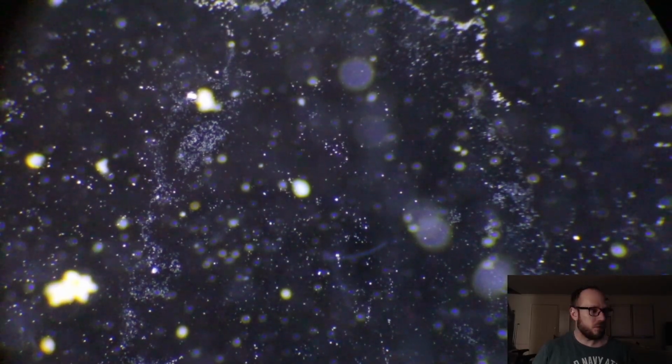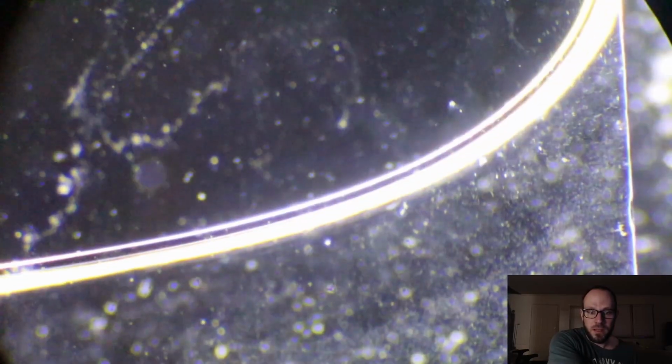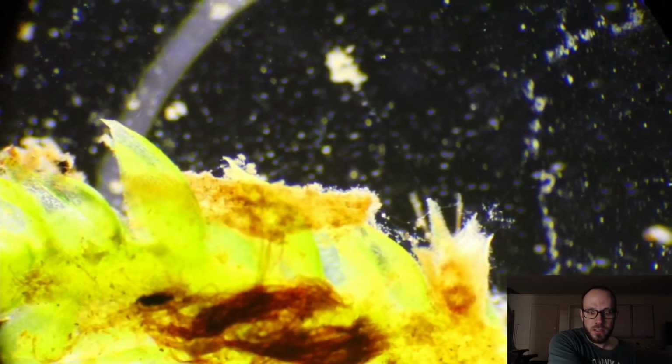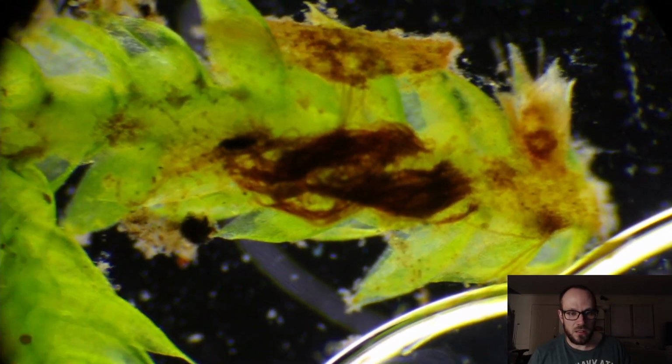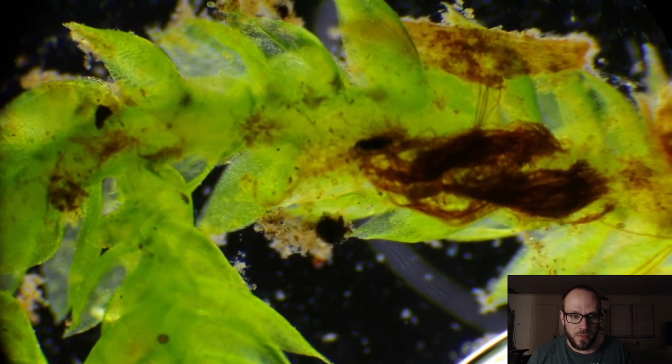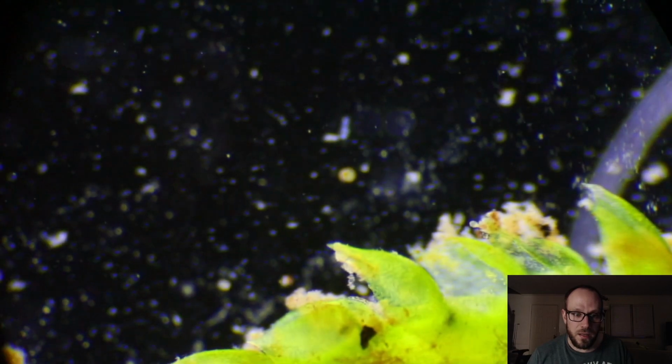All right, so welcome to this slide. It is a sample of moss that I took from my yard on the first week I had this microscope, in September. There's a little swimmy guy, I don't care about him. So here's some of the moss. Now, the moss being like this introduces trouble in that there is a lot of depth to the slide. There's a nice Z-axis. But, there we go. There's a living rotifer. Finally.